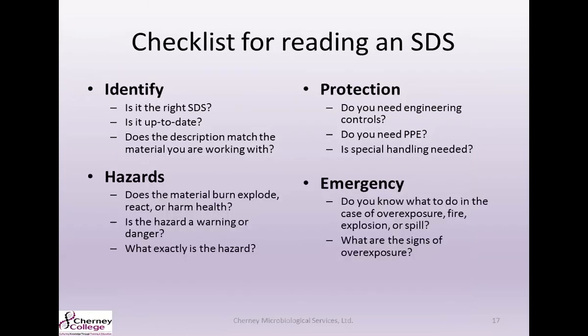So a checklist for reading an SDS, you're going to want to identify, is it the right SDS? Is your SDS up to date? And does it match the description of the material that you're working with? You're going to want to know the hazards. Are there any of those special signifiers? Is it going to be corrosive? Is it a compressed gas? What hazards are you going to be dealing with? As far as protection, you're going to want to look over that SDS so you know what special PPE that you need, any special handling, and you're also going to want to look on that SDS to know what you're going to do in case of a spill or an emergency.